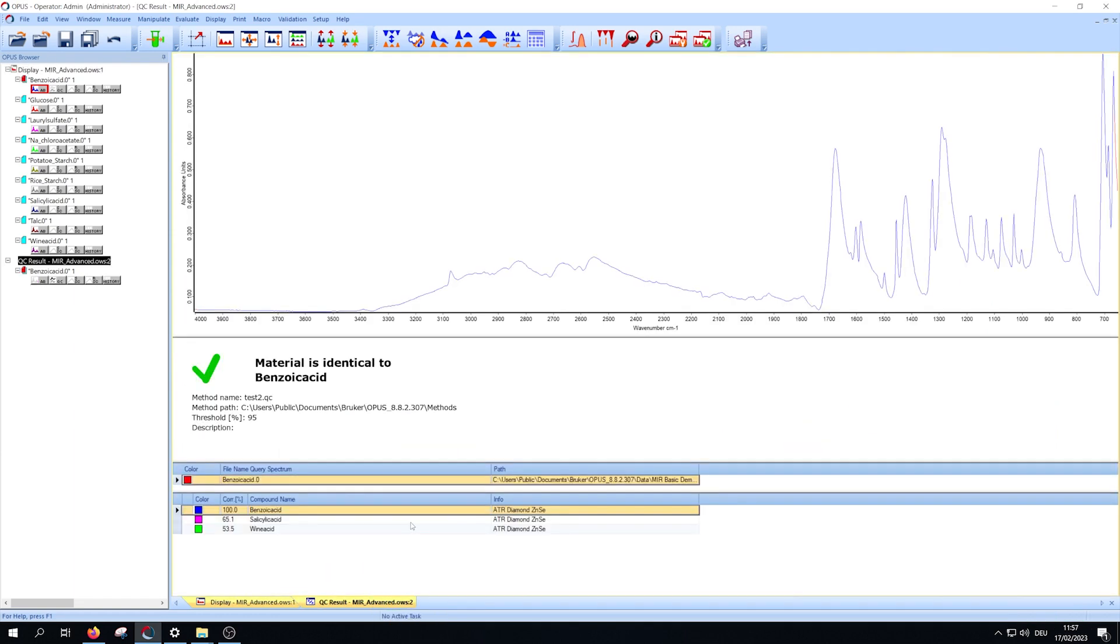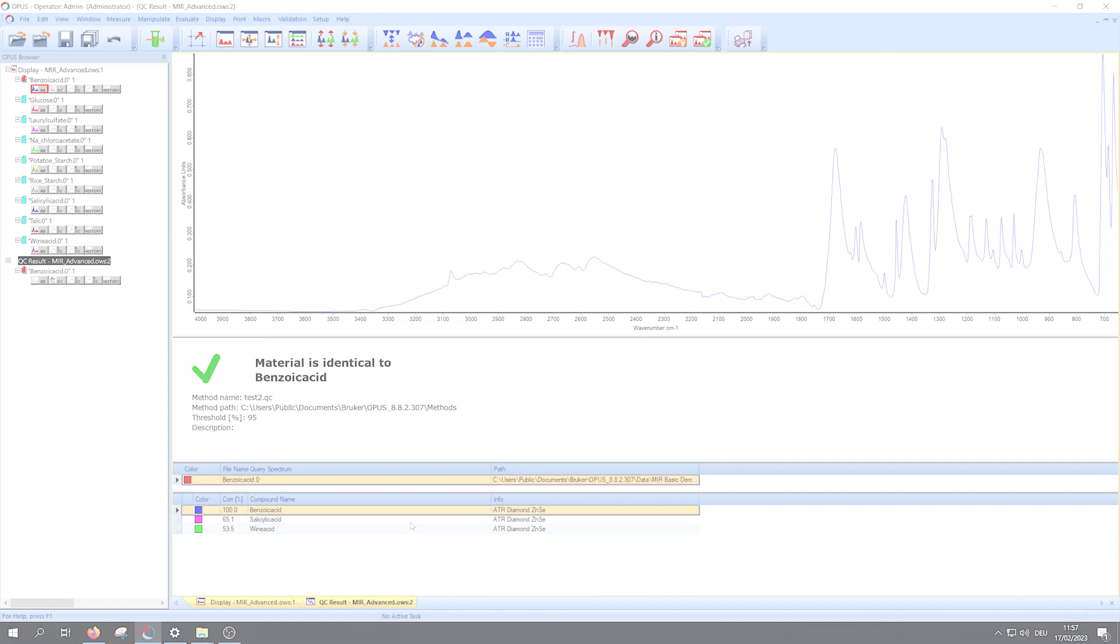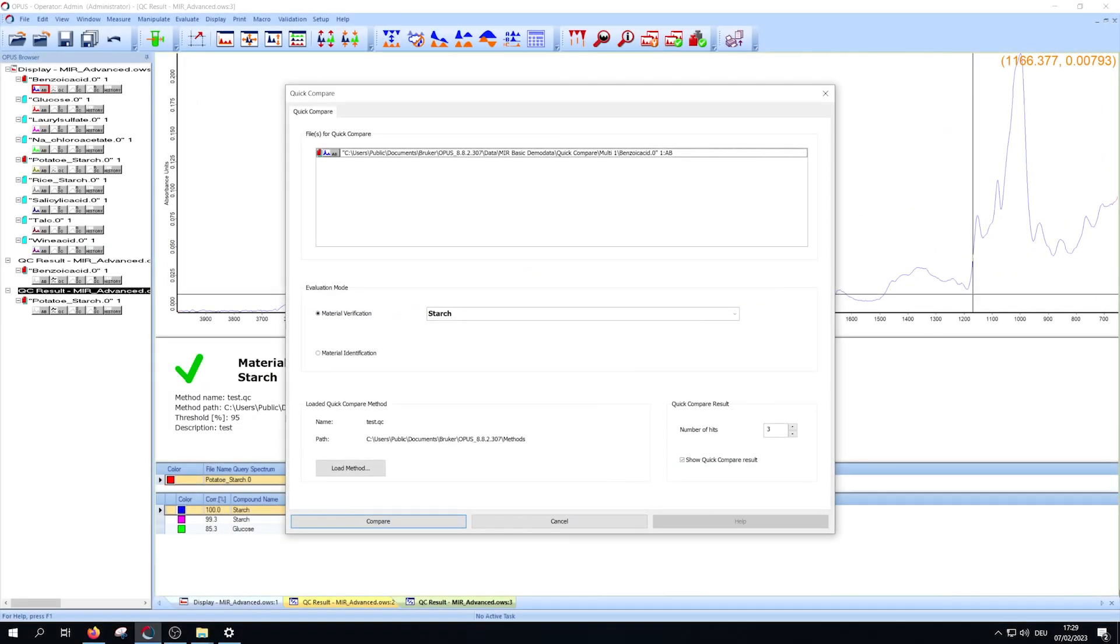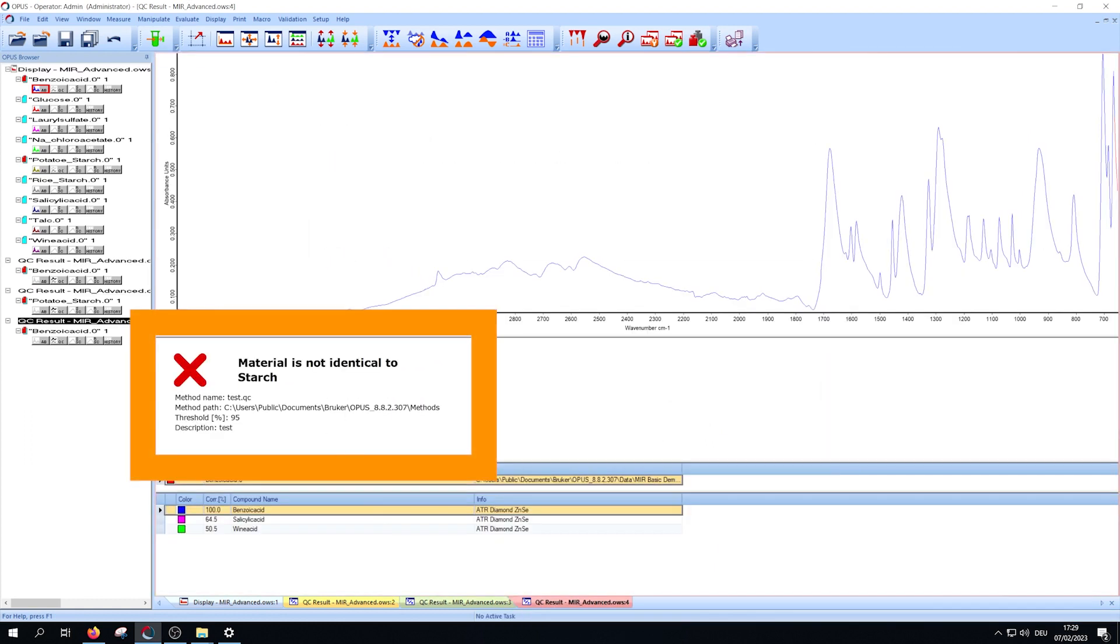If the material is correct, you will get the result 'material is identical to.' If the material isn't correct, you will get the result 'material is not identical to.'